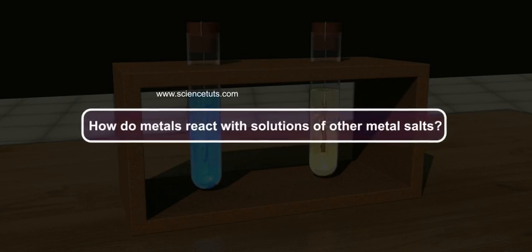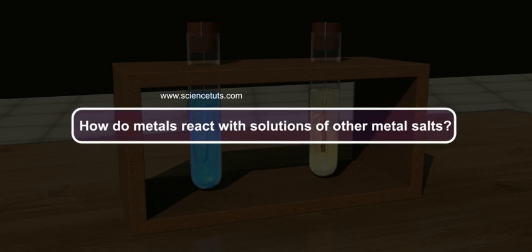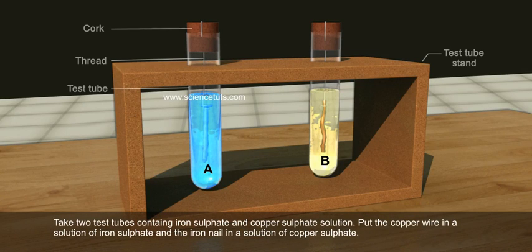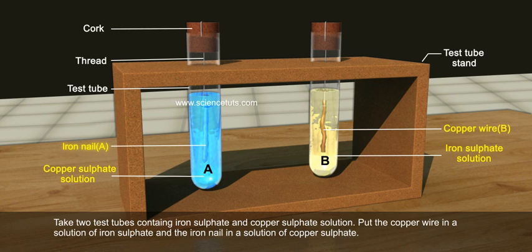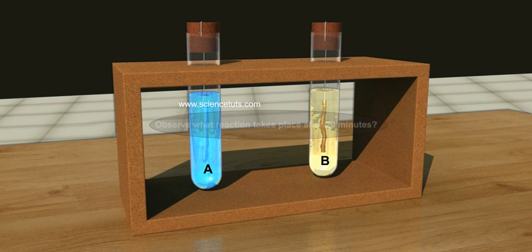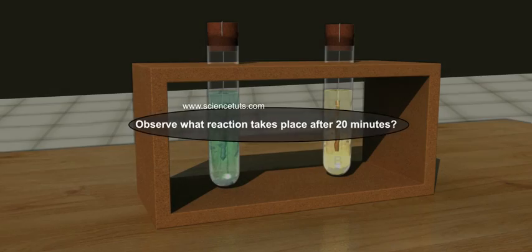How do metals react with solutions of other metal salts? Take two test tubes containing iron sulfate and copper sulfate solution. Put the copper wire in a solution of iron sulfate and the iron nail in a solution of copper sulfate. Observe what reaction takes place after 20 minutes.